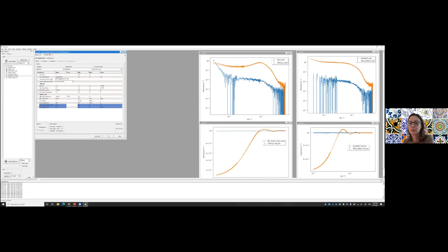You will have decided what pH you want to use, so you know if you expect your molecule to be charged or not. And you decide how much salt you put in there. So there are a number of things that you already control to some extent. Okay, I don't know if you have other questions. But yeah, try different options, and then if you have other questions, you can always drop me a message.